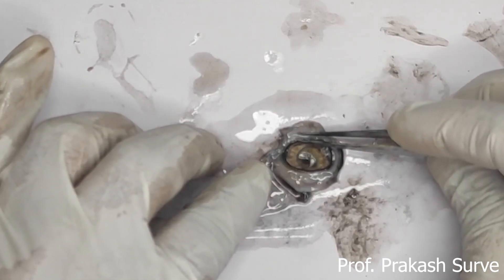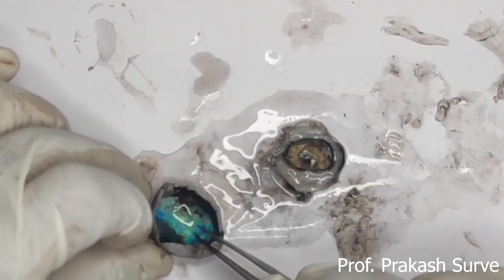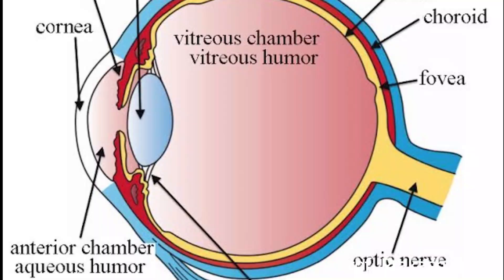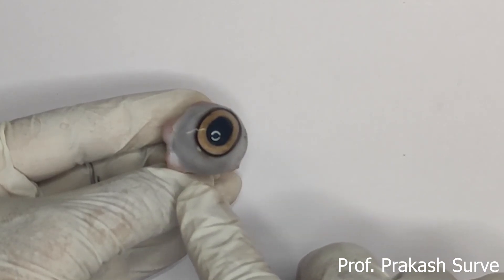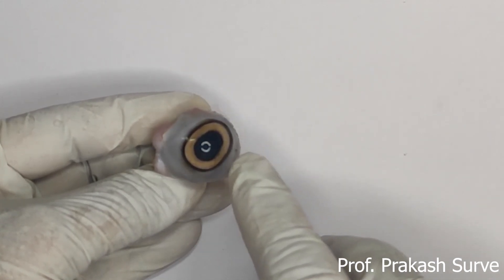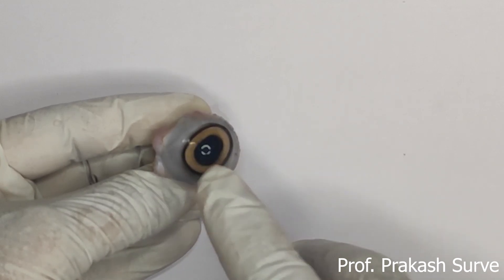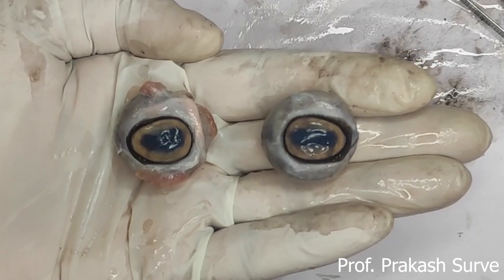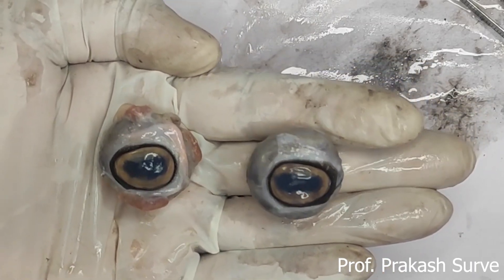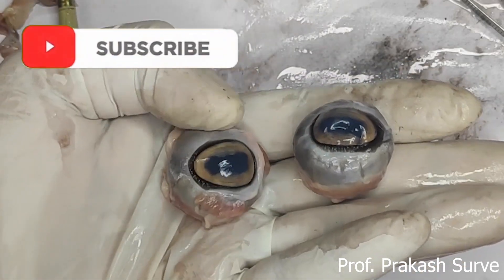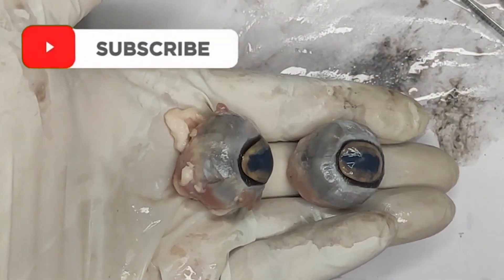This way we can get a clear idea about how the eye looks. Inside the eyeball portion is the retina, along with the vitreous humor. Looking at the whole eye again: the sclera, then the iris, then the pupil at the center — the iris maintains the shape of the pupil through which light passes. Both eyeballs can be observed, and the movement of the eye is adjusted by six sets of eye muscles, allowing movement in the upper, lower, and side directions.